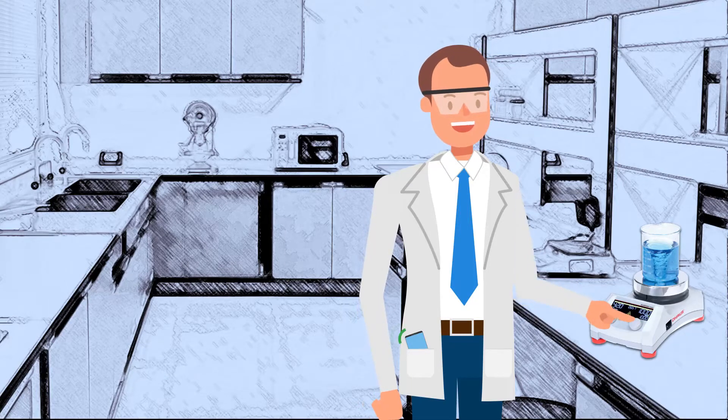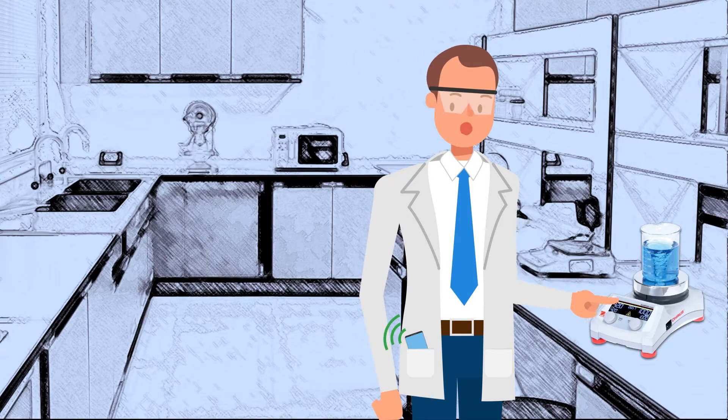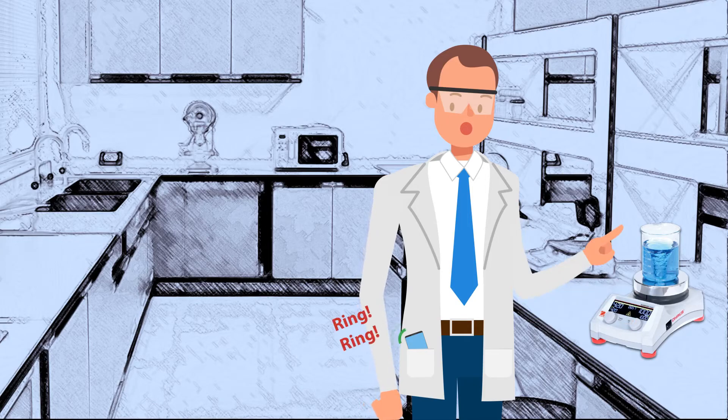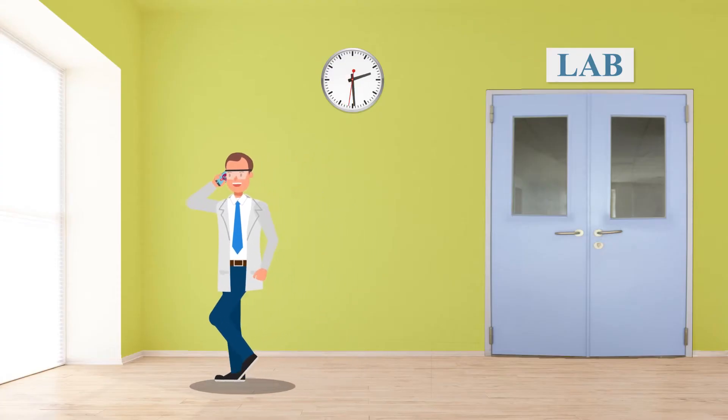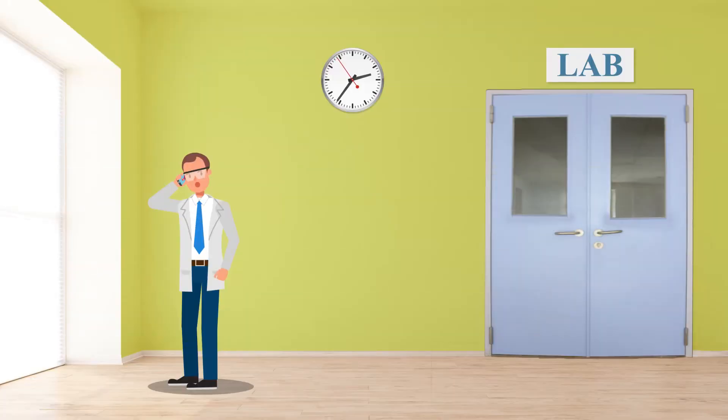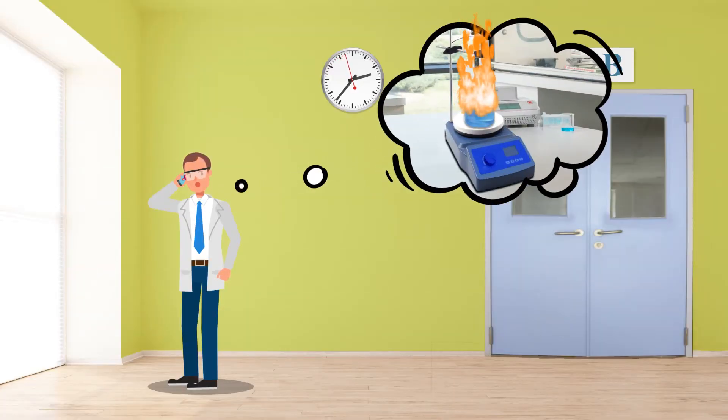Hot plates and hot plate stirrers left unattended are one of the major causes of laboratory fires and accidents. Lab operators understand the importance of observing safety protocols, but it only takes one mistake to create a catastrophic situation.